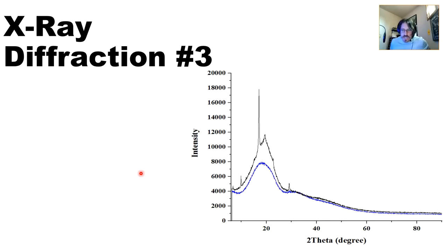X-ray diffraction is pretty much the way we use it these days, a flavor of spectroscopy. And so we look at lines on a screen. Here's an example of some recent work that we're doing in the lab. This is a polymer spectra, and polymeric materials do indeed exhibit a flavor of crystallinity. We're going to be talking about crystallinity and crystal structure and how that interacts with X-ray diffraction for this lecture. So I thought a spectra like this was quite appropriate to start the lecture off.